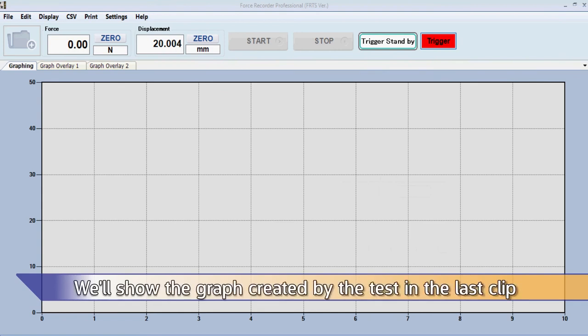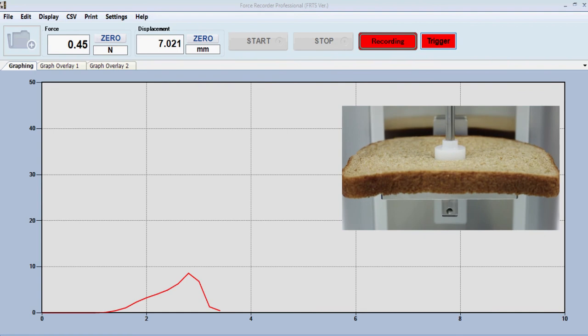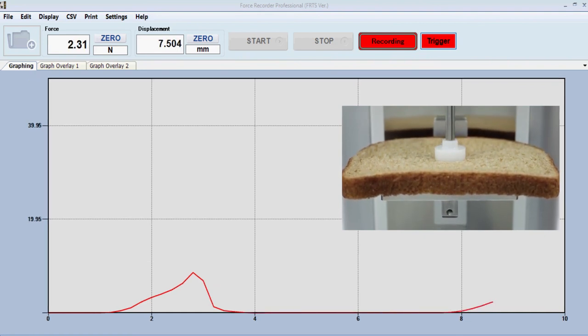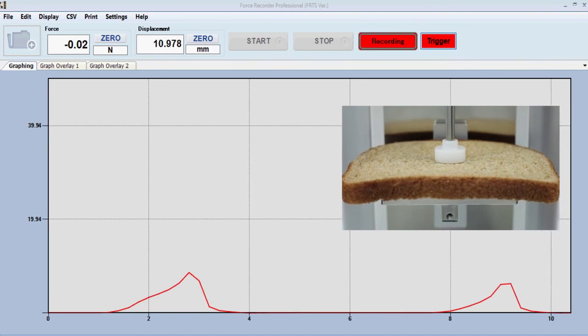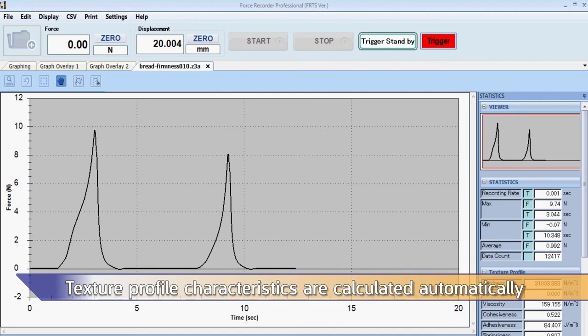We'll show the graph created by the test in the last clip. The texture profile characteristics are calculated automatically within the software.